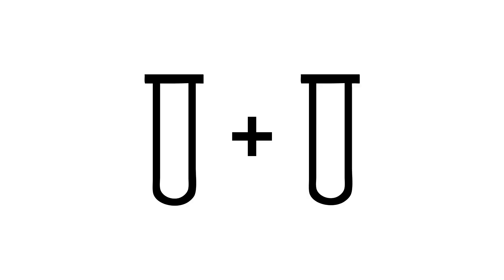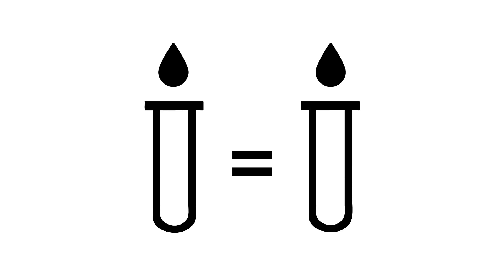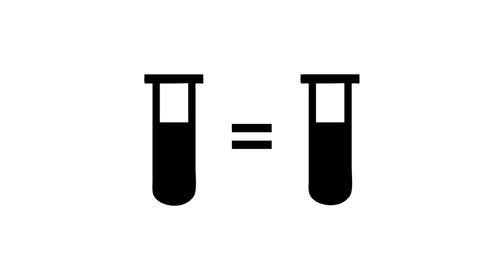If you're spinning an odd number of tubes, you'll need a counterbalance tube. First, figure out which of your tubes needs the counterbalance — it'll be the one without a balance tube across from it. Then get an empty tube of identical size and volume and fill it with water. The counterbalance should be roughly the same weight as your filled tube. Then place it across from its partner tube.